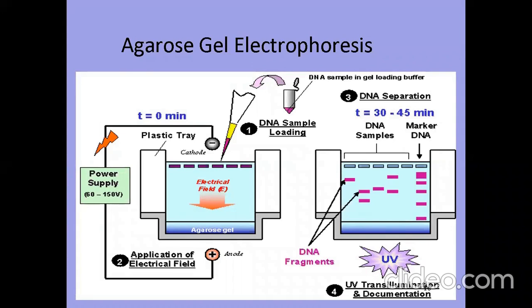And even in our lab we don't have even good quality gloves. We use plastic gloves. So in that case we have to avoid ethidium bromide. Okay, those are porous, and these sort of things would be taken into consideration as well.